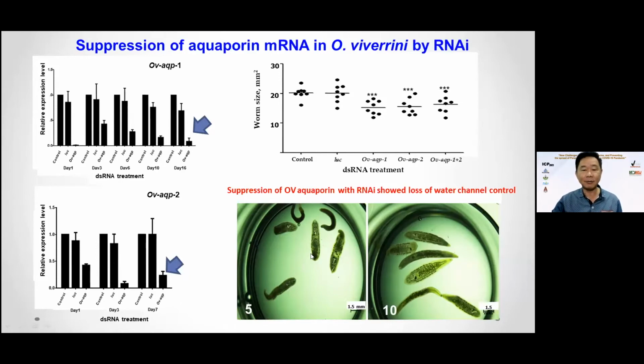Normally worms have to stay in isotonic solution. If you incubate the worm in water, that is a hypotonic solution, the worm will swell.